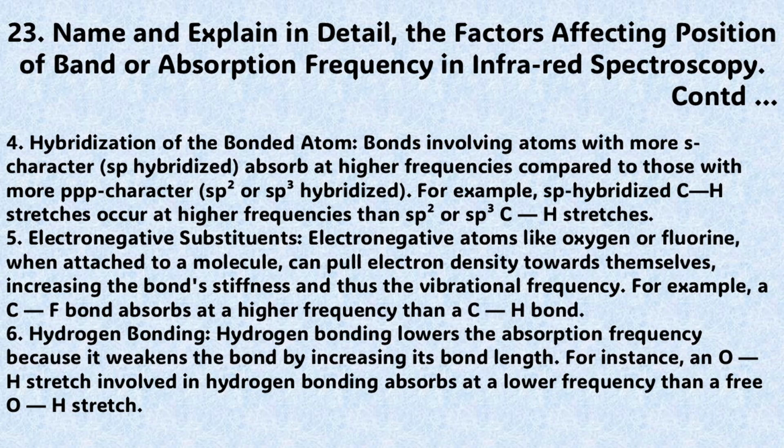Electronegative substituents: electronegative atoms like oxygen or fluorine, when attached to a molecule, can pull electron density towards themselves, increasing the bond's stiffness and thus the vibrational frequency. For example, a C-F bond absorbs at a higher frequency than a C-H bond.